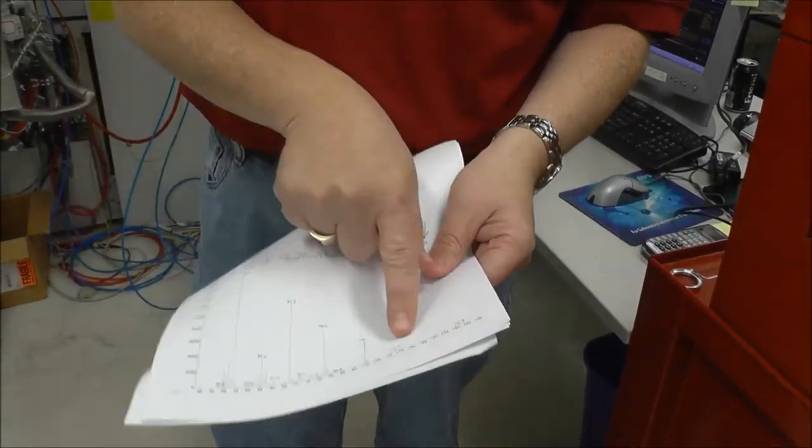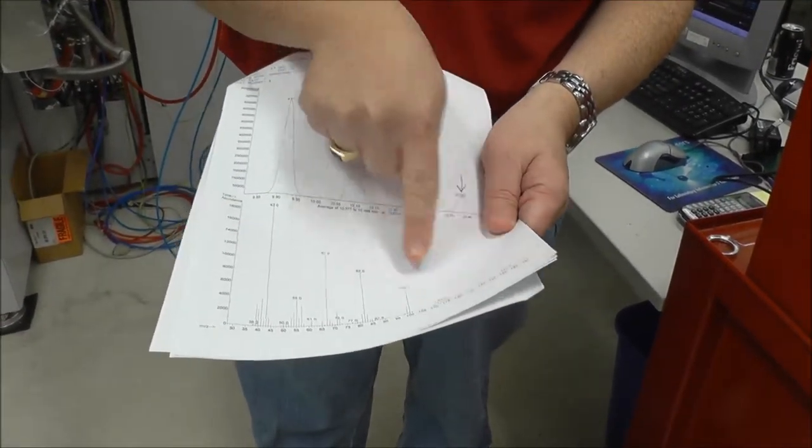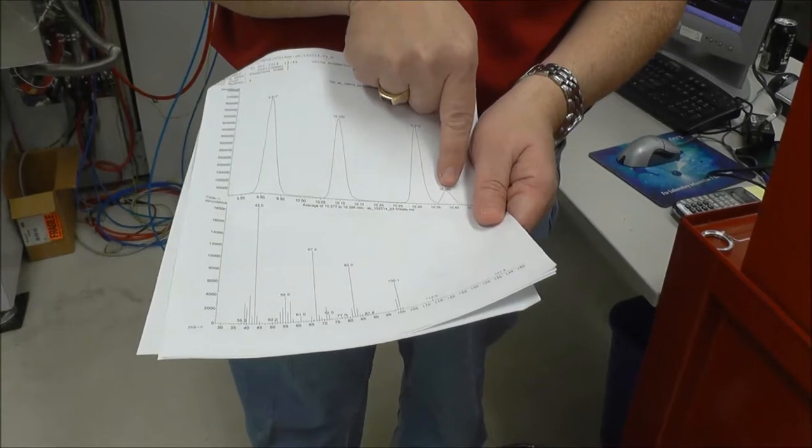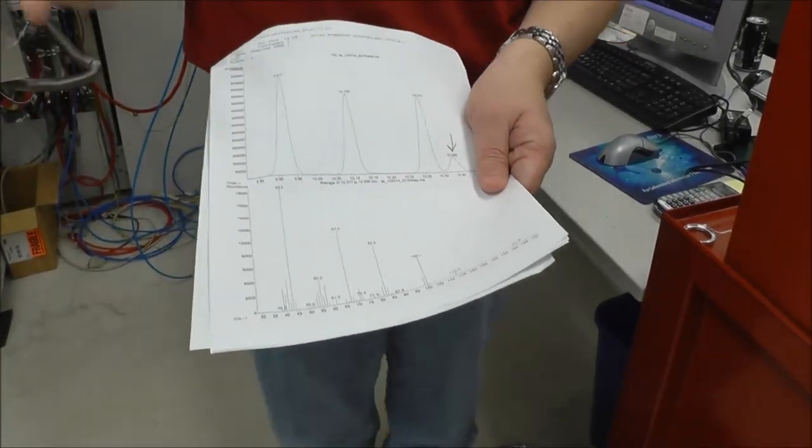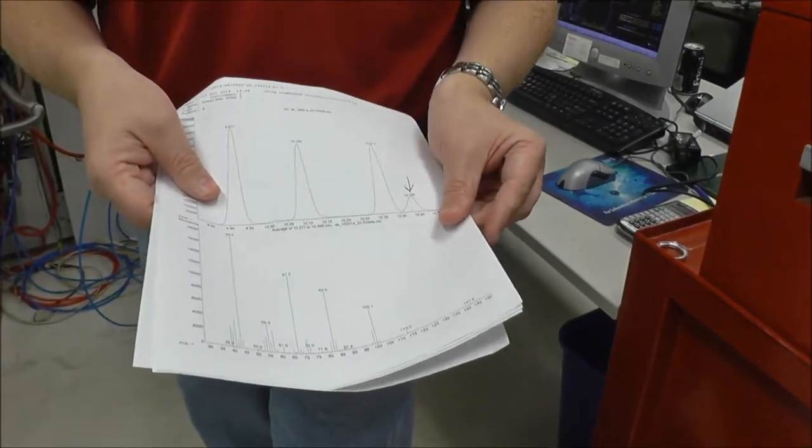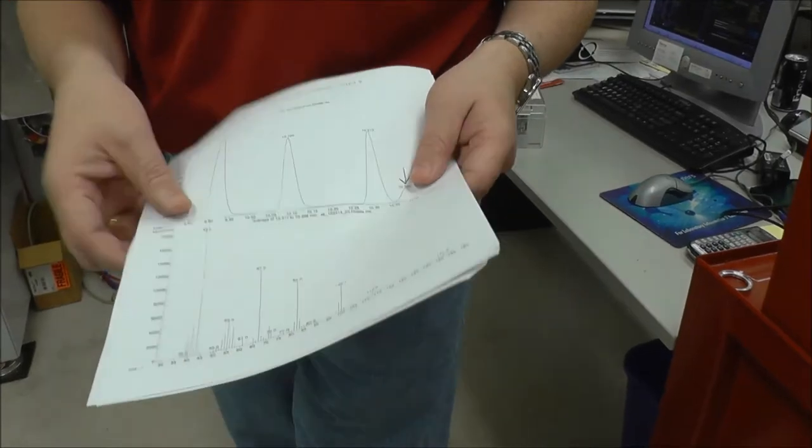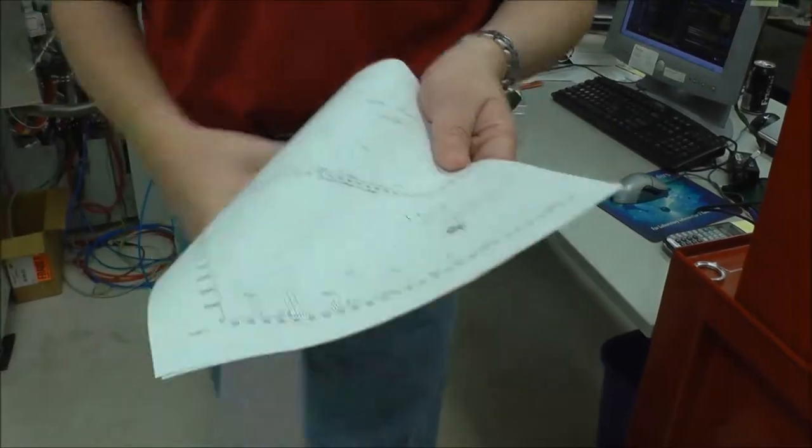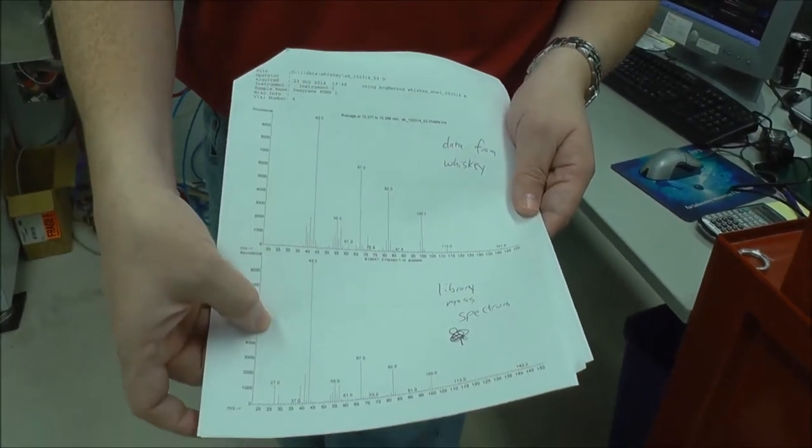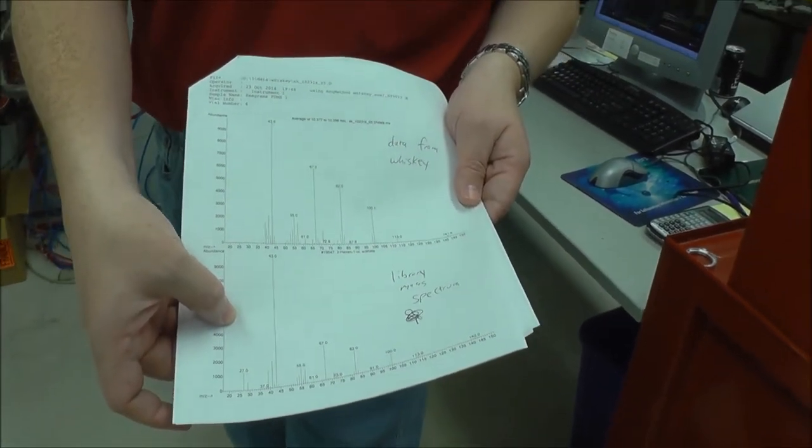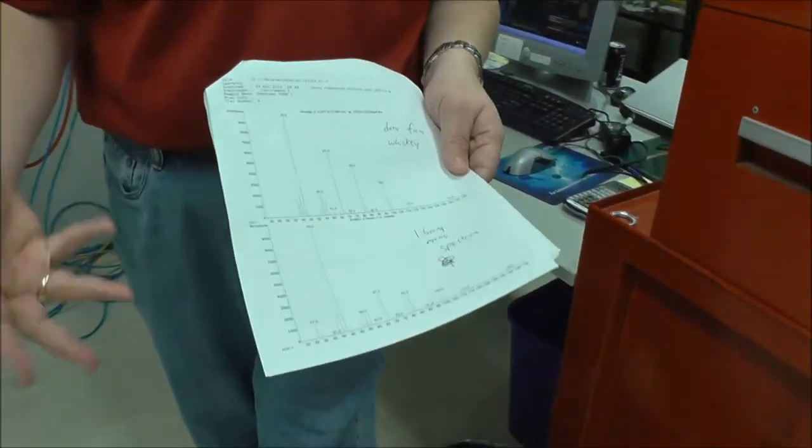What this represents, this is the mass spectrum, what molecule was coming out at that point in time. The molecule thankfully falls apart based on its chemical structure. And we have purchased, and the government maintains, a library of common compound mass spectra. And so here's the spectrum that we observed. There's the library mass spectrum for something called hexanol acetate that tastes like apples. And so that's one of the components in Seagram's Seven Crown.